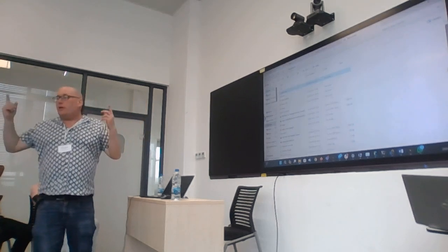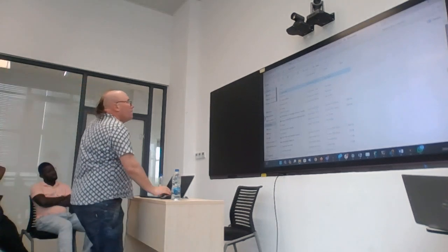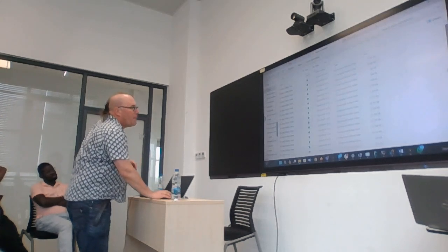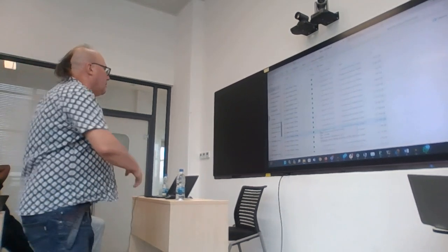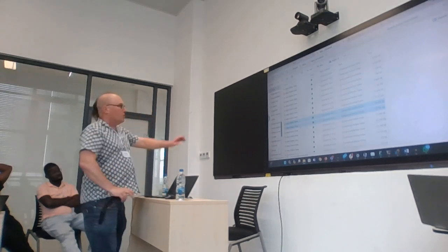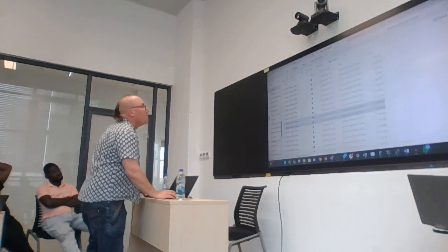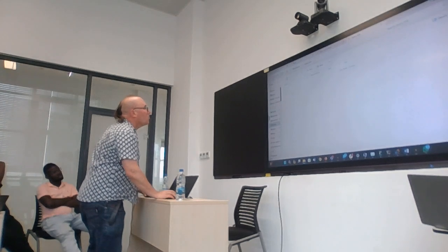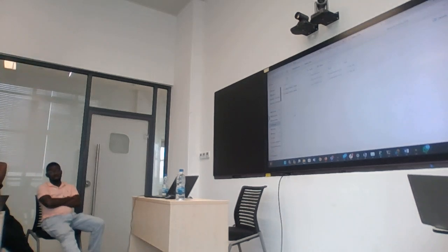The name isn't really important, but I only want to put one sample in for the first time I run things. So now I'm going to go back to here, and I'm going to choose one of the samples that has a nice size, okay? So I'm going to choose maybe this one, the 1 and the 2, just 1 and the 2 from the same thing, and I'm going to copy, and I'm going to put it in my Mpox1. So can everybody make a folder and put one sample in that folder?